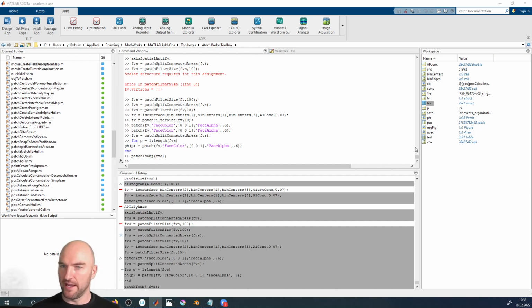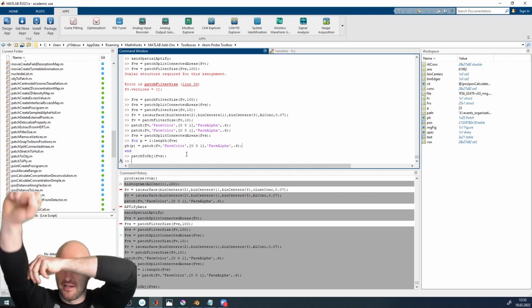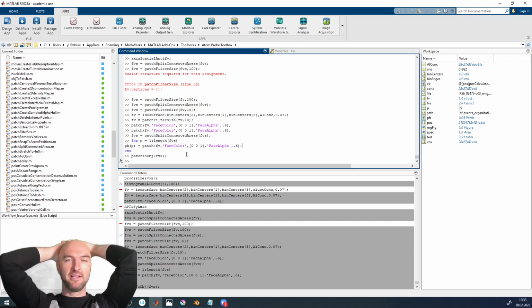Good. So we now know how to create analysis objects, interfaces. We haven't worked with line objects. We haven't worked with point objects. But a lot of you are probably interested in some kind of interface, and these are planar objects. And we now know how to create planar objects in some more sophisticated ways, in some less sophisticated ways.